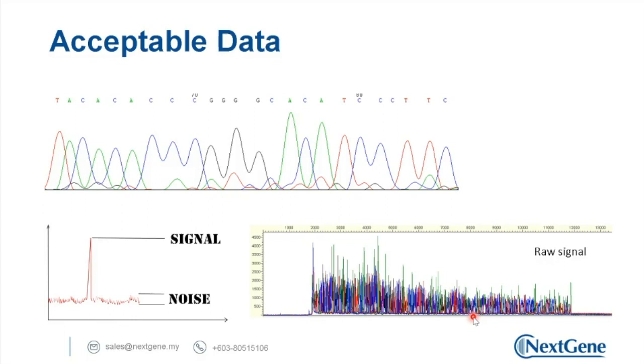One more thing. In your method, you mentioned that the first step is to denature the double-stranded DNA, correct? So if we send single-stranded, will you also denature? I'm not sure, but I think so. It wouldn't affect anything. We didn't do the cleanup, actually. In our electrophoresis, we see a few bands, two or three bands. That also happened previously.